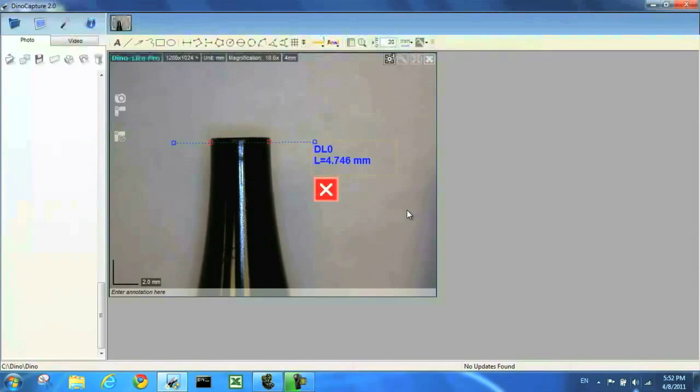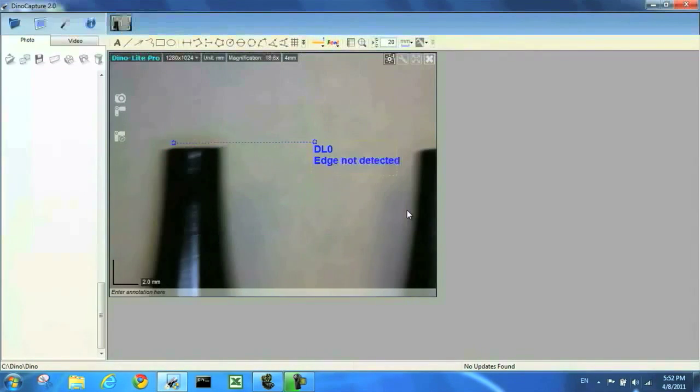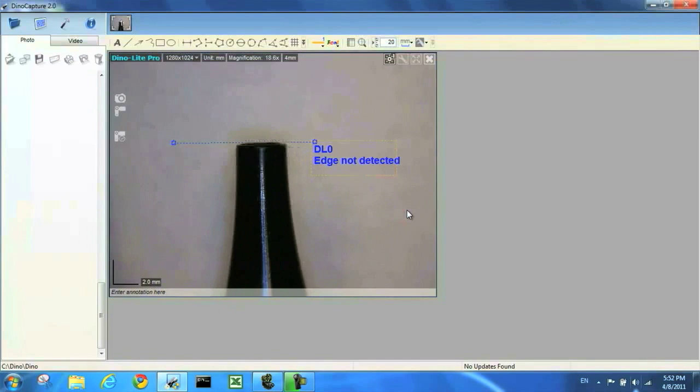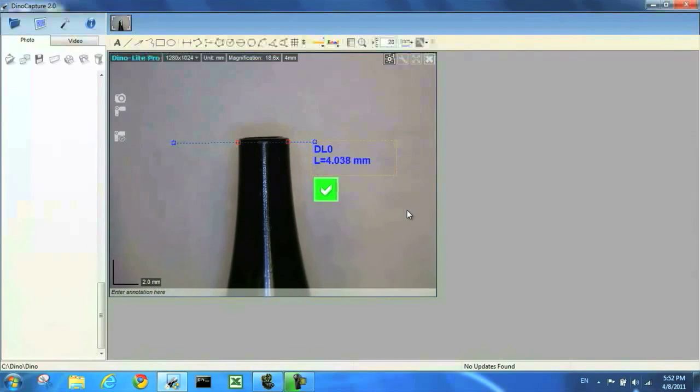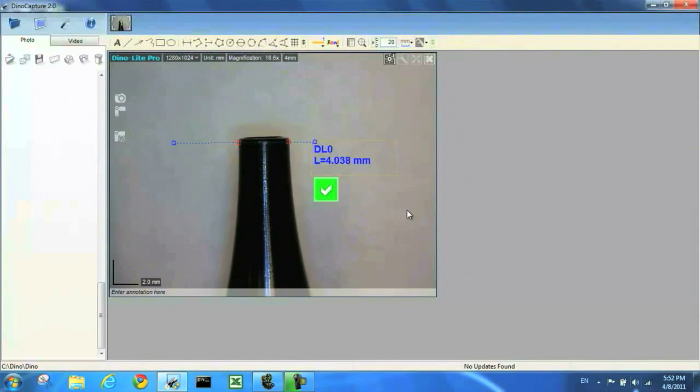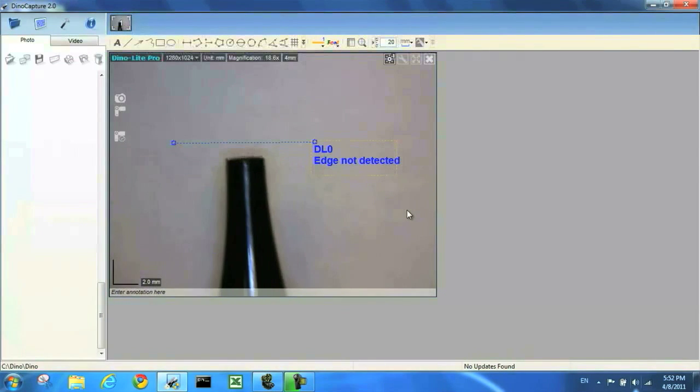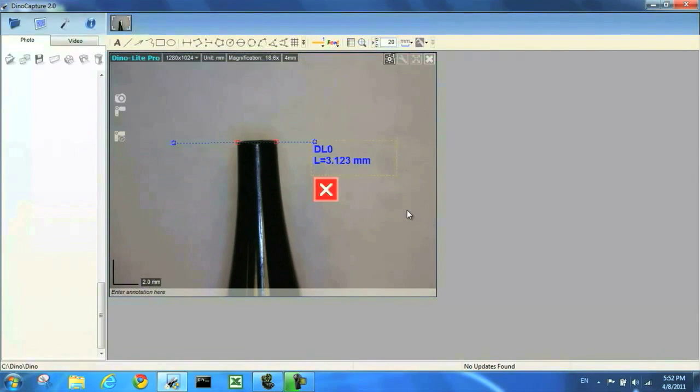Now my first part here is too large, so it doesn't pass. This middle part is within tolerance. And the last one is too small.